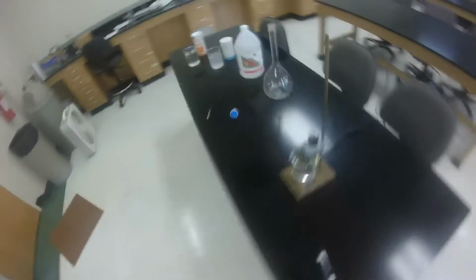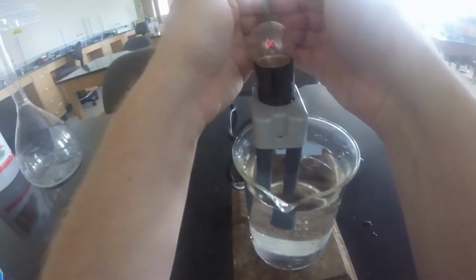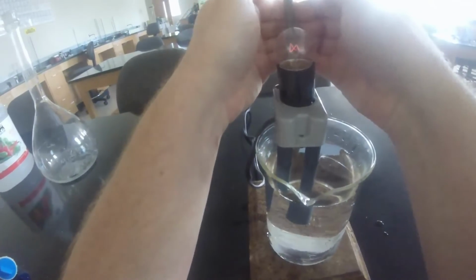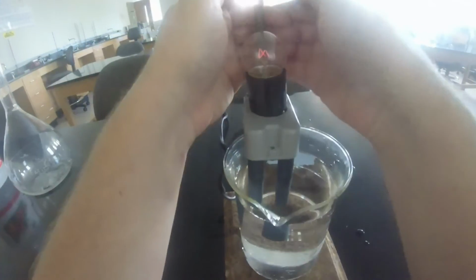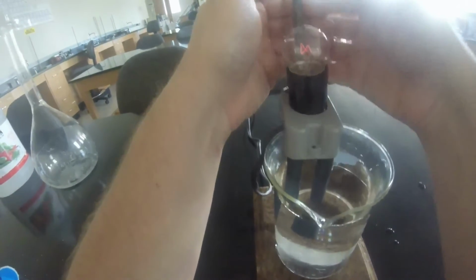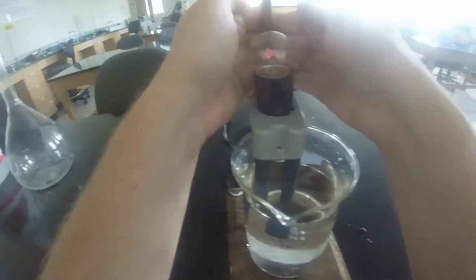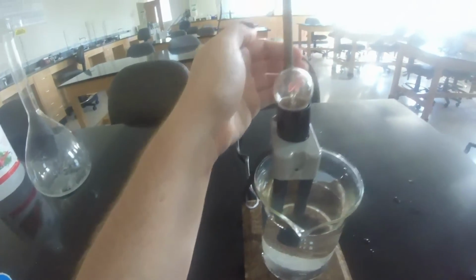Okay. Now, I can see it glowing, but for video's sake, we may actually have to turn the lights out. Can you guys see that? Okay, so it's very faint. That's our weak electrolyte. So we have just enough of those ions that break apart from our weak acid that will be able to carry some of the charge. Not all of it like we saw with that strong electrolyte, but just a little.